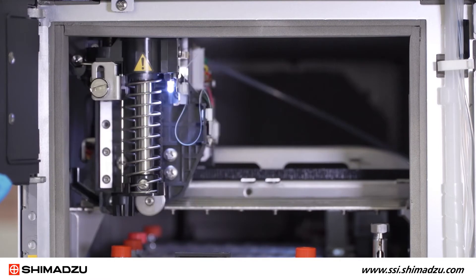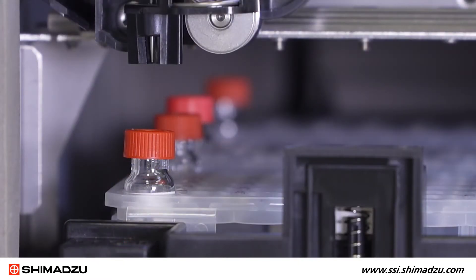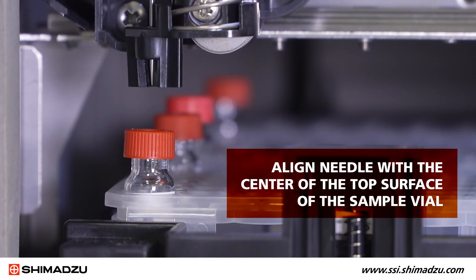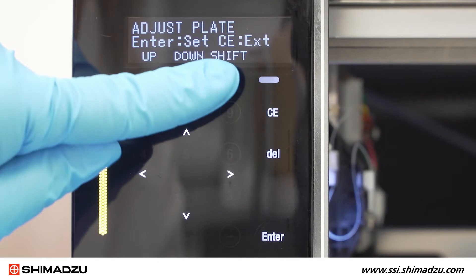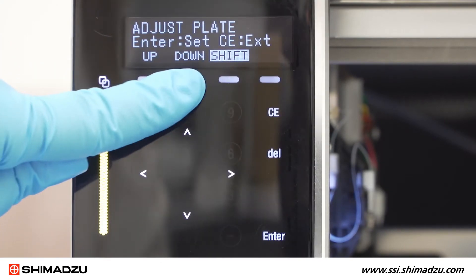The needle should move and stop at the front left corner on the front plate. Adjust the needle position with the operation keys so that the end of the needle aligns with the center of the top surface of the sample vial located in the front left corner on the front plate. You can use shift with the operation keys to move the needle ten times as far as it does normally.